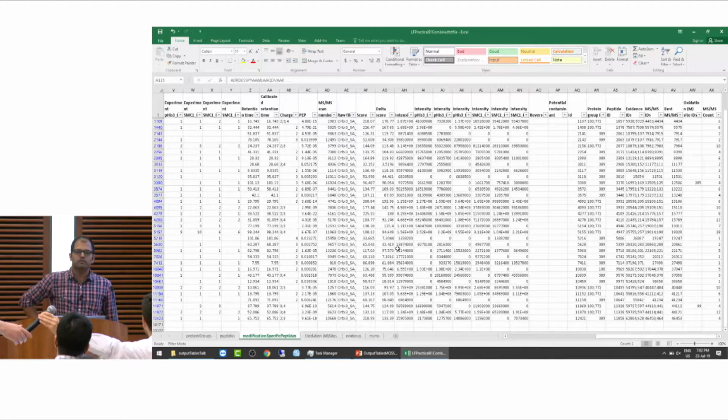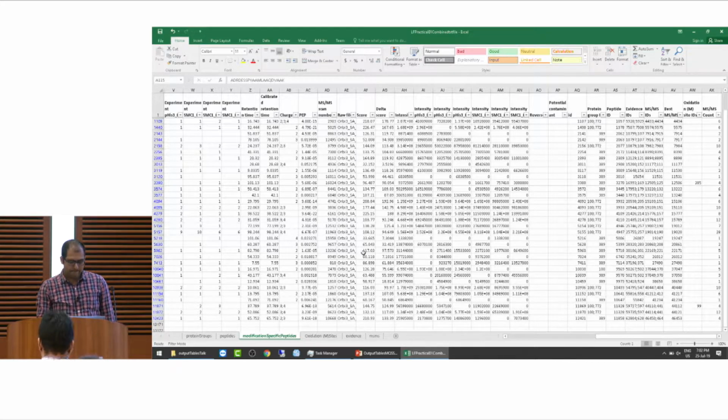And my second question is about the mass error. That makes a lot of sense and is very useful for label-free searches, but when there is TMT labeling, the mass error seems to include the mass of the TMT tag as well, and then it's on a ridiculously high scale. Is there a way to get the actual m/z error that doesn't include the TMT label?